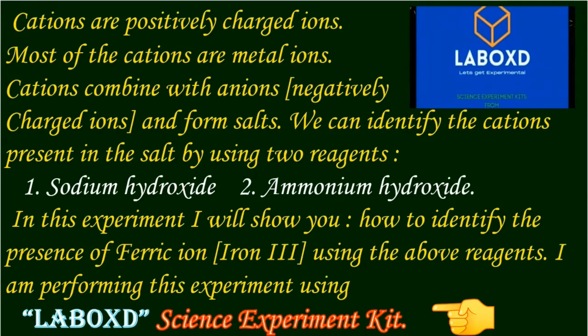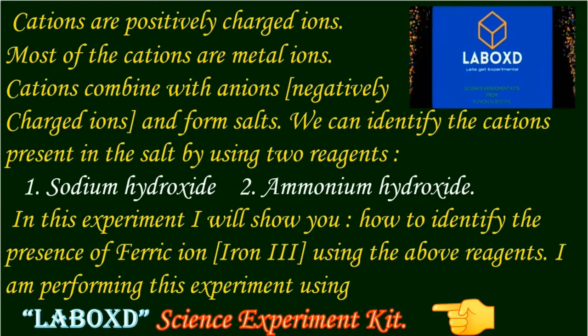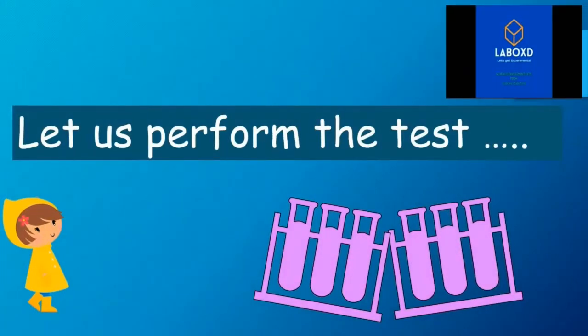I am performing this experiment using Laboxd Science Experiment Kit. I hope you're ready for the experiment. So, let us begin.